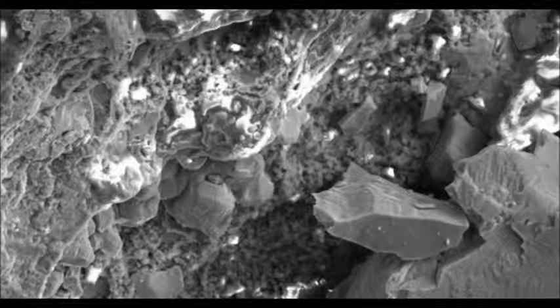Scientists have released microscopic images of fragments of the meteorite that hit central Russia in February. A team from the Ural Federal University was able to analyze some of the dozens of samples as soon as they were found. But the technique they used allowed them to assess the rock's chemical makeup at the microscopic level even as they snapped pictures of the fragments. This will provide extra information on the space rock's formation and journey.